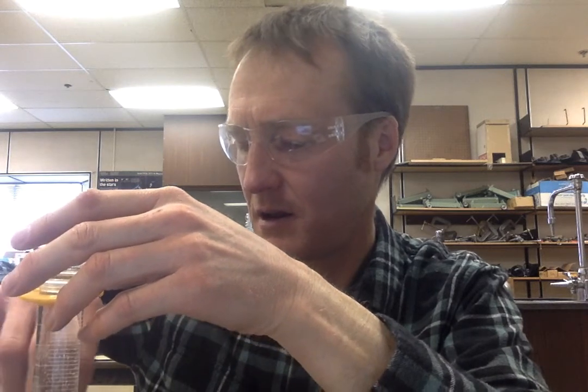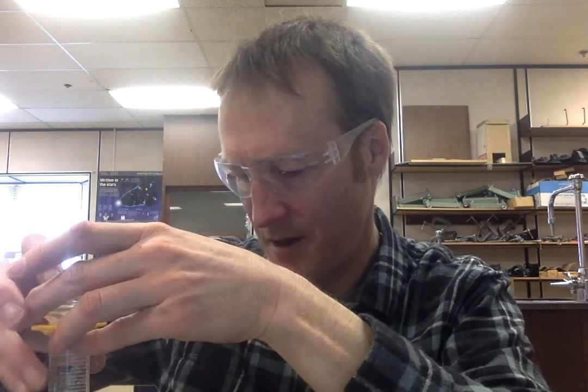Clearly the zinc does nothing. It's still at 20 degrees Celsius. The temperature in the calcium beaker started to go down just a bit. Now it's at 23. Temperature in the foil is now at around 32 degrees Celsius. Maybe that's going down a little bit. I'm going to add some more calcium to this. All right, there.